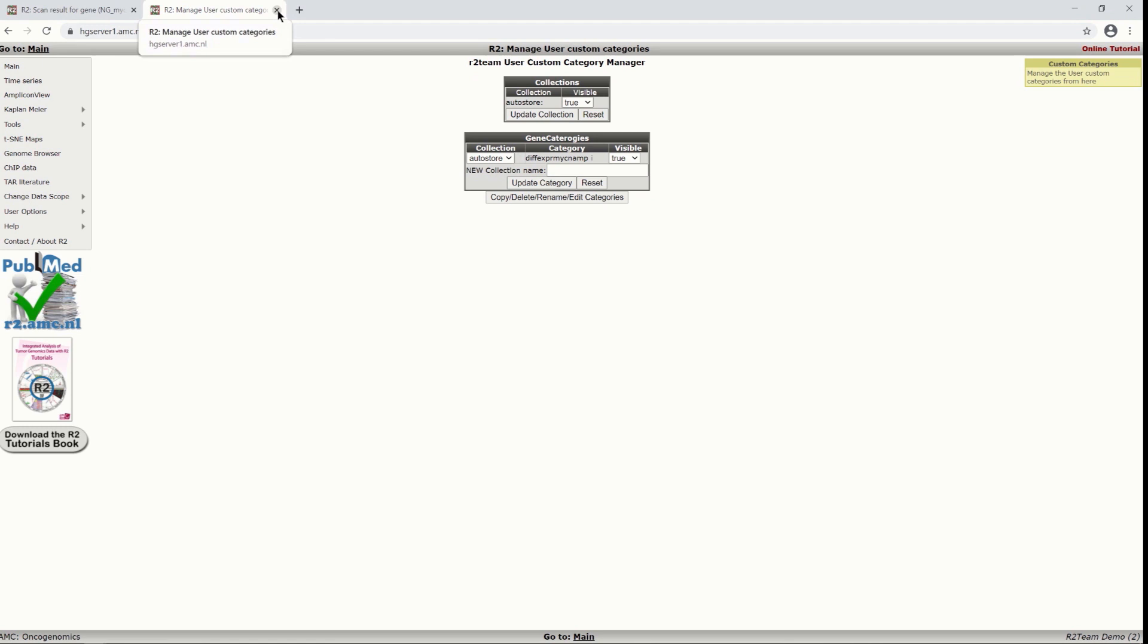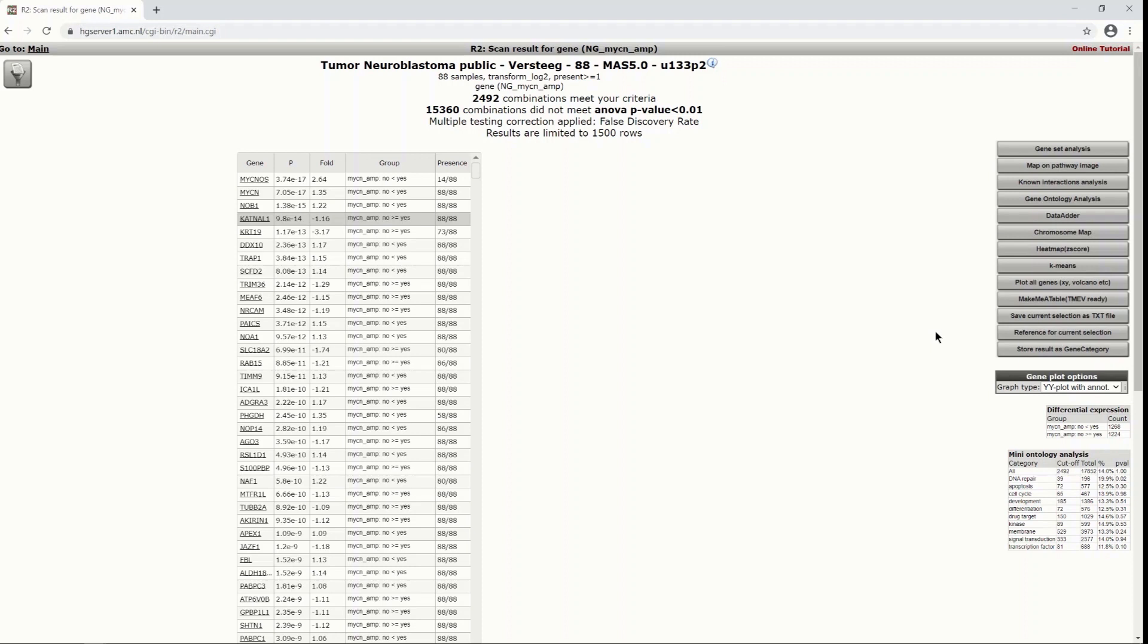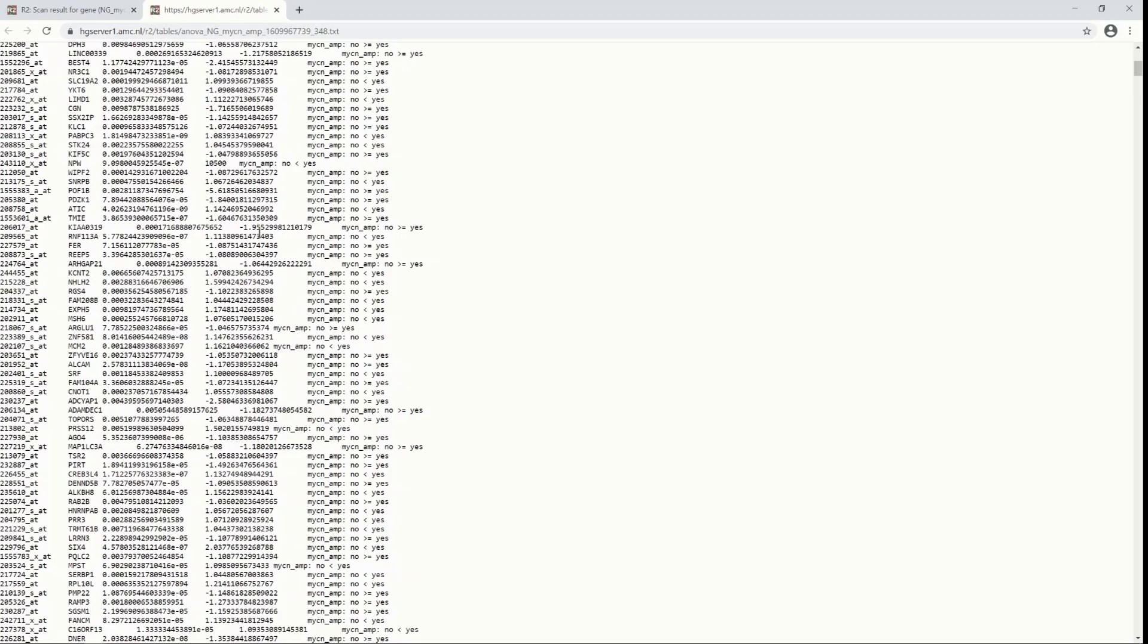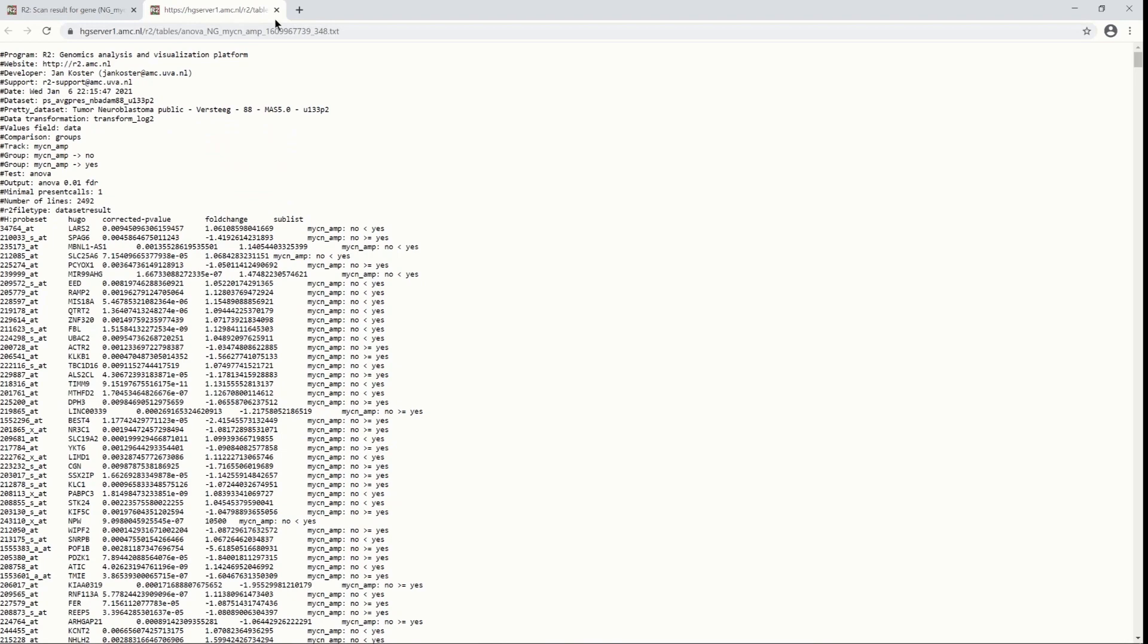Let's click this away such that we come back to the list of differentially expressed genes from our previous analysis. And then you also have the option to simply export your results by choosing this button that says save current selection as text file. And as you can see, you have here a normal text file that you can store on your computer.